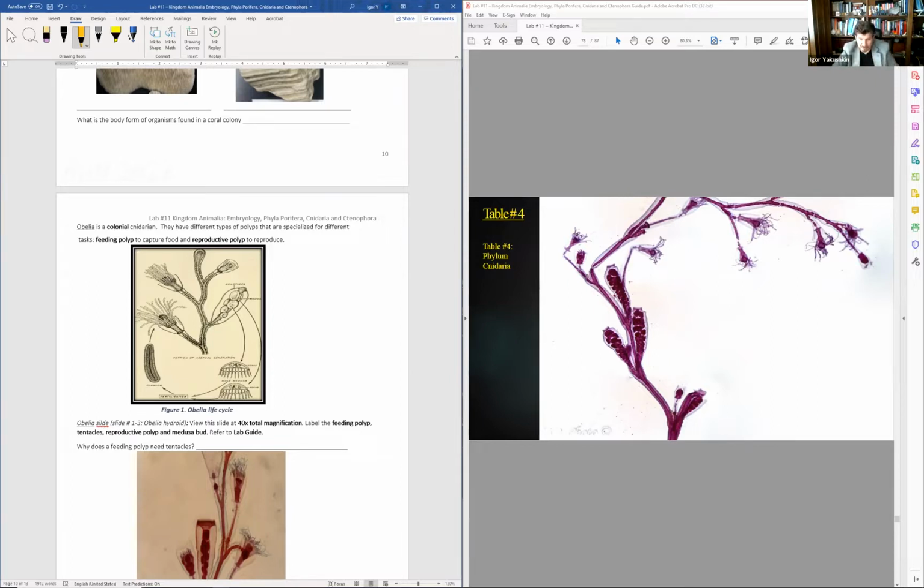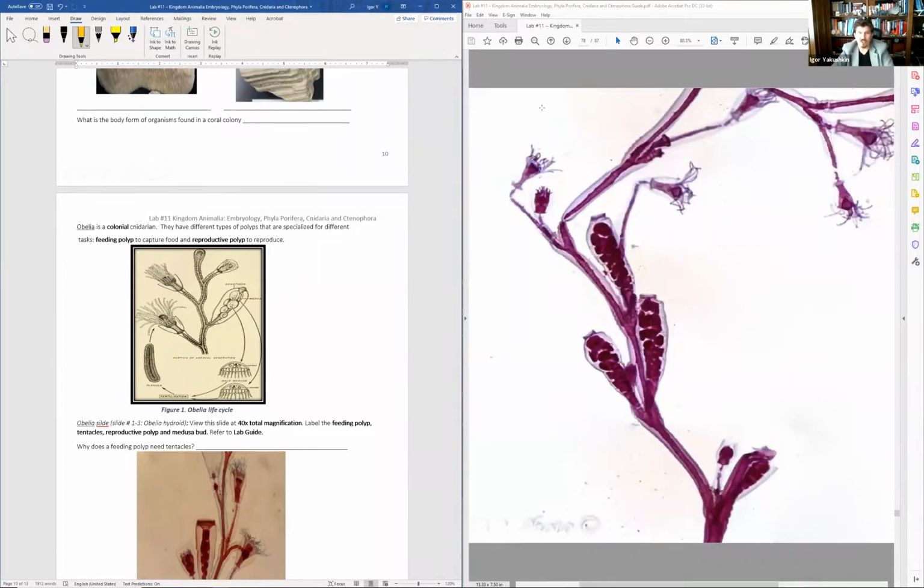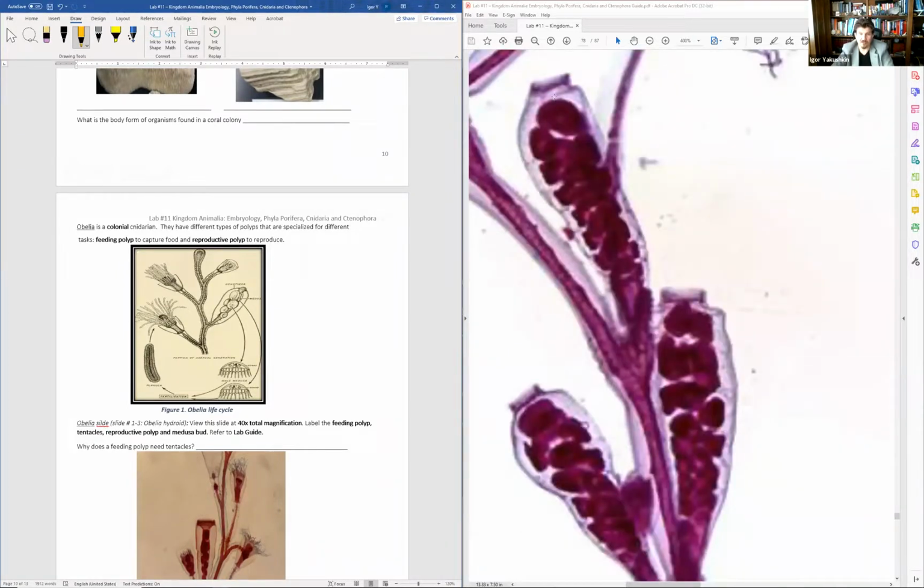And now there is a different type of polyps, which are right here. Those ones are known as the reproductive polyps. You can see that they are literally creating a tiny little bitty jellyfish inside. So that jellyfish will literally pop out and it will be a tiny little bitty one. And it will start free swimming, and then there will be another one popped out and so on.